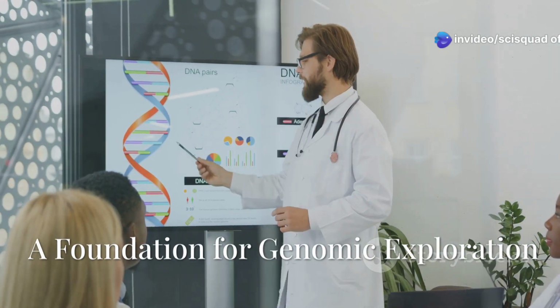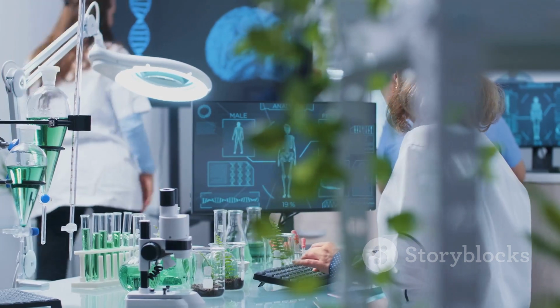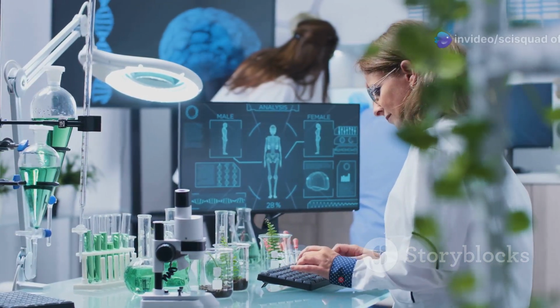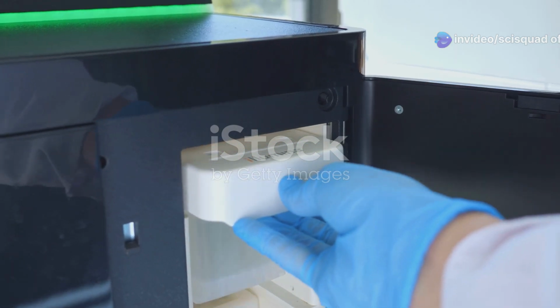Section 6. Sanger's legacy, a foundation for genomic exploration. As we venture deeper into the 21st century, the landscape of genomics continues to evolve at an astonishing pace. Newer, high-throughput sequencing technologies have emerged capable of decoding genomes at breathtaking speeds.